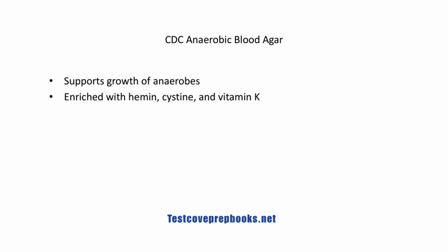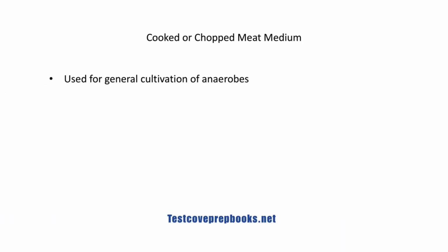anaerobic organisms. Finally, cooked or chopped meat medium is a traditional enrichment medium that provides nutrients for the cultivation of a wide variety of anaerobes. It is particularly useful for maintaining viability in the laboratory.